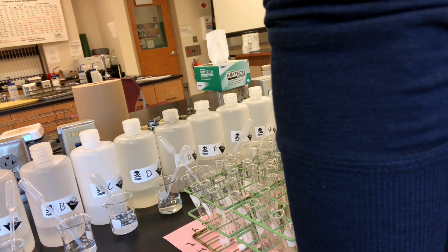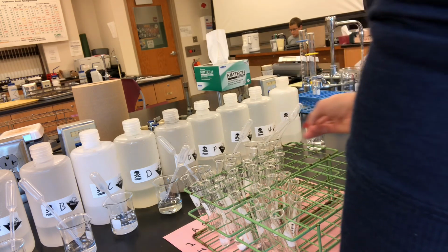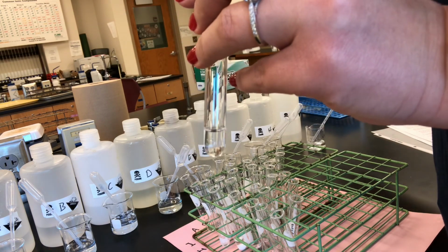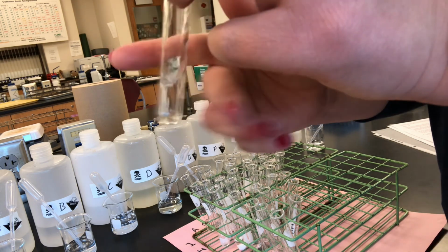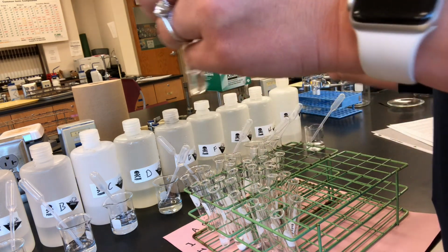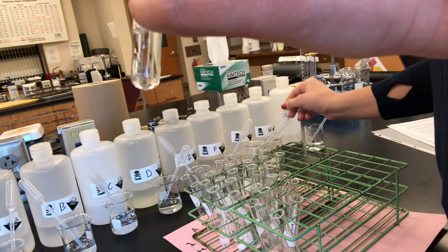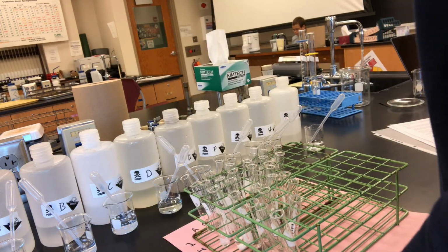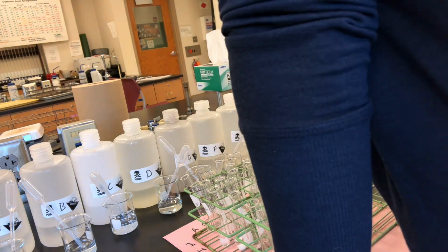All right. Adding G to two tubes. G gets mixed with I, so I've got G here. Mix it with I. No change. G and H. Got G, I'm adding H. No change. So these no changes are just as useful as your actual precipitates.